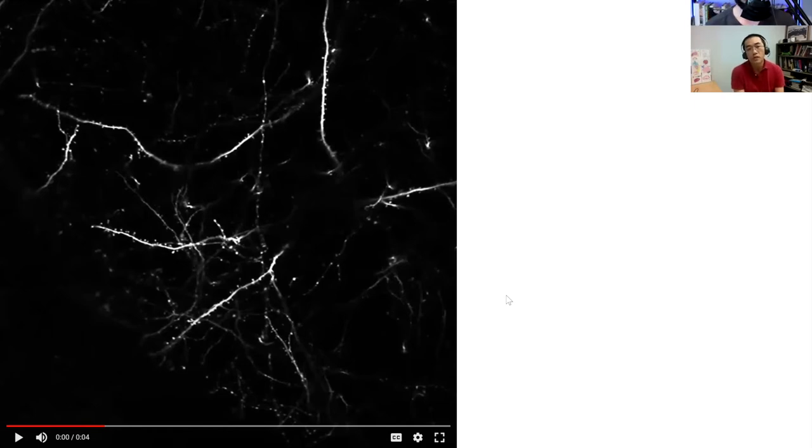So what you're seeing in this video is that we're taking an image, and then we take another image that's a little bit deeper, about two microns deeper, and then you go another segment deeper, and then you go another deeper. So this movie basically shows you as you go into the brain, how that dendritic branching changes. And you can see the organization of those dendritic branches. One of the things to note is that we're still kind of on the top of the brain, right? So this imaging is done from the surface. That's why you don't actually see the cell body. What you see is just the dendrite that come out of the cell body. The cell body is too deep to see here.